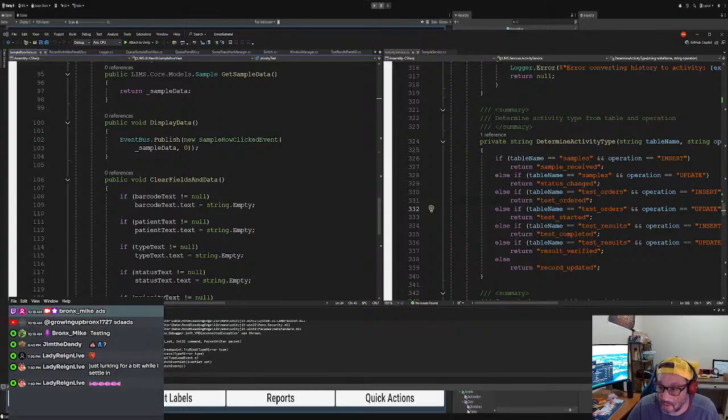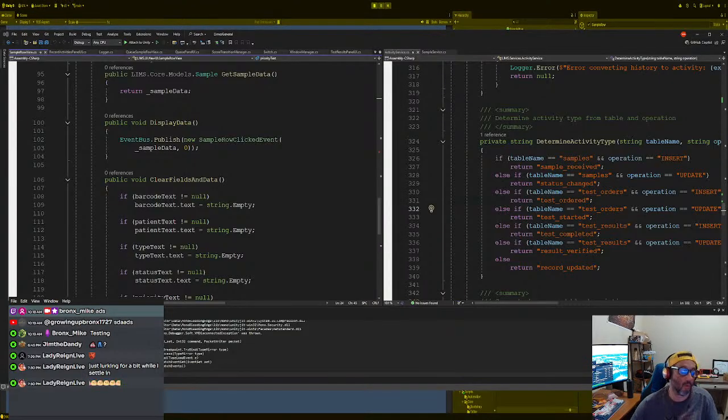It just takes forever. Okay, let's see. All right, let's run it one more time.